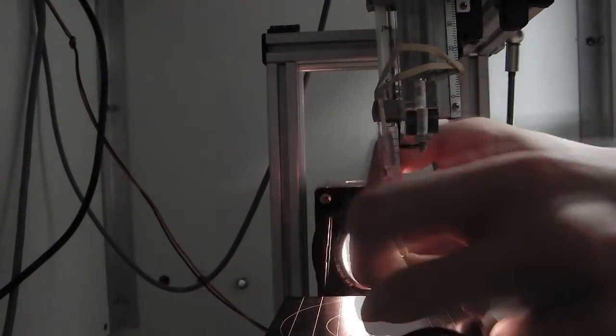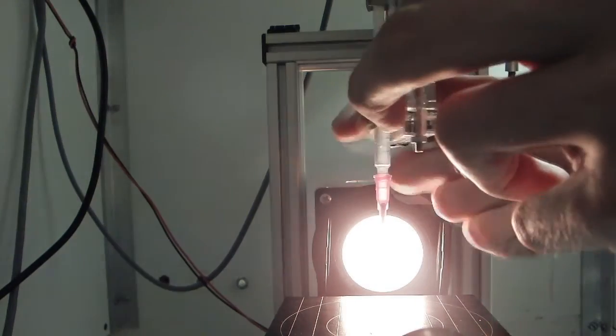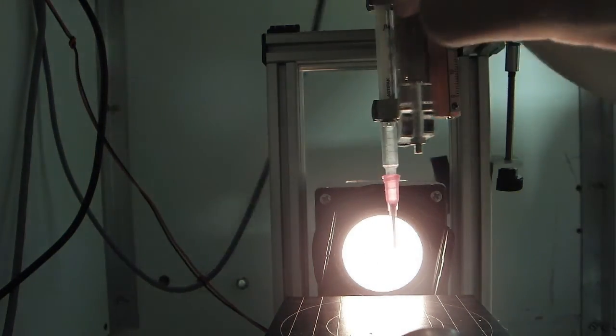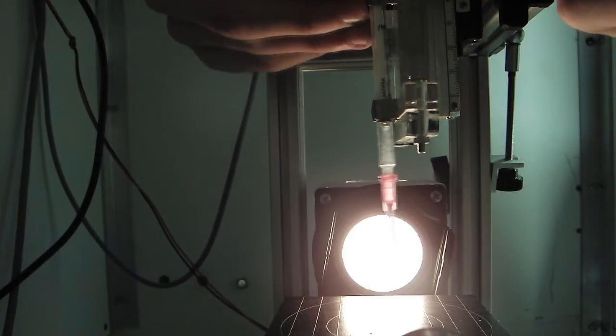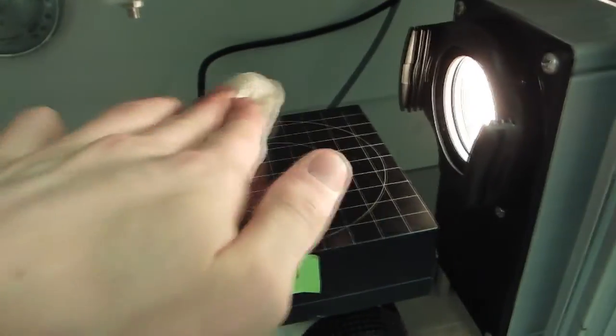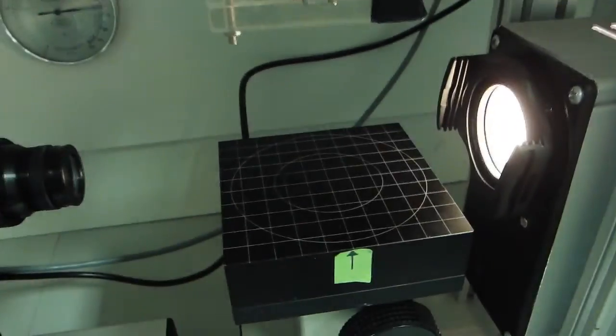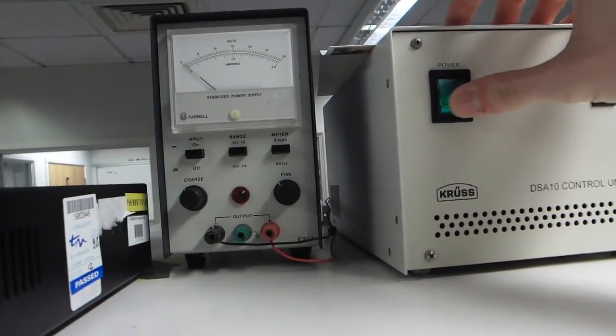Removing the rubber band and undoing the retention screw allows us to remove the syringe. Finally, we wipe down the stage and turn off the power to the backlight and the syringe control unit.